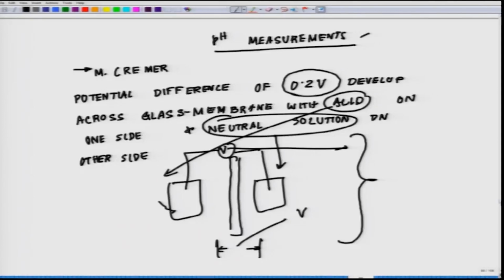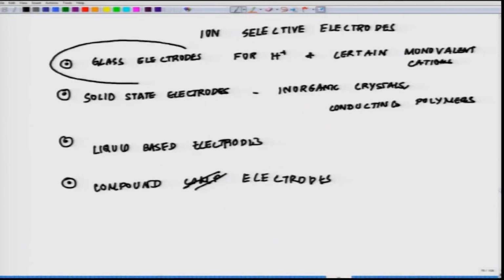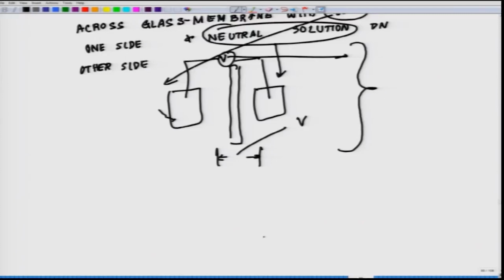If you remember, when I showed you the classification of the different kinds of electrodes, I talked about glass electrodes for H+ ion concentration. So, this is that glass electrode. A glass electrode used to measure pH is the most common ion selective electrode. A typical pH combination electrode incorporating both glass and reference electrode has a line diagram something like this.